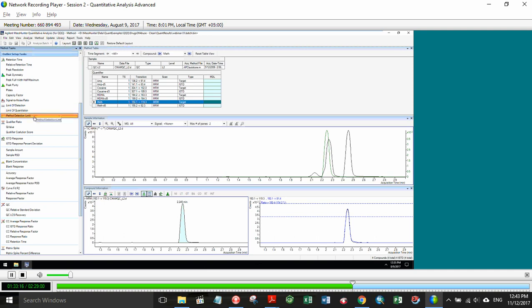And then a method detection limit has a slightly different definition, but again, it's one-dimensional where I'm only interested in values that fall below this, so I can't really flag a LOQ, LOD, or MDL if it's above. It would not be an outlier in that case.